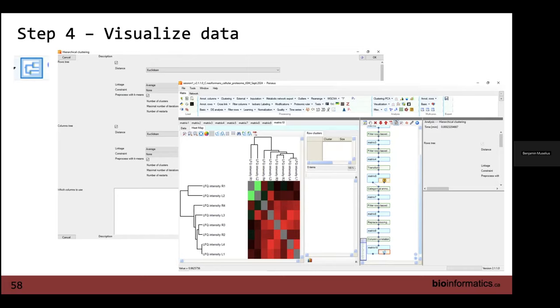I would say at this stage, because all of the information is certainly contained here, it's just how you want to present it. Is there something about your data that makes sense for you to use a different method of presentation? Then certainly do that. There's nothing wrong with it. It very much depends on how you want to present it.